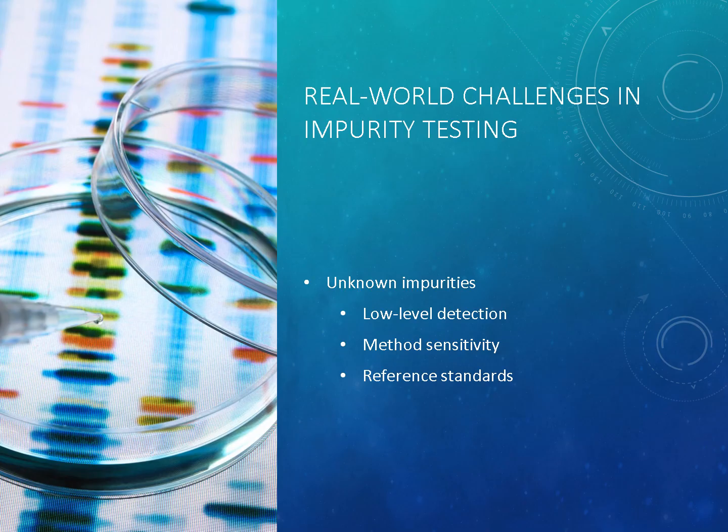In real pharmaceutical laboratories, impurity testing presents several challenges. Unknown impurities may appear without reference standards. Some impurities exist at extremely low levels, requiring highly sensitive analytical methods. Method development and validation can be complex, especially when regulatory expectations are strict. These challenges require scientific judgment, risk-based decision-making, and clear communication with regulatory authorities.